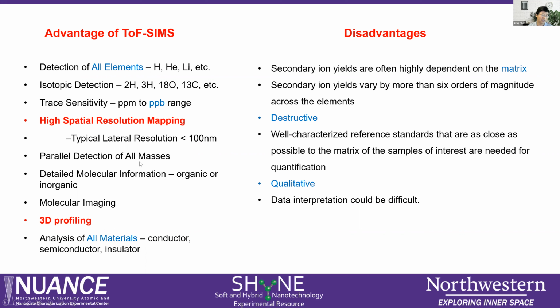And then parallel detection, that is very useful. For some method like XPS, you detect 2 elements and 10 elements, total different time. And if you analyze 10 elements, you spend like 2 hours on 1 element less because in theory to detect. This one is parallel. Once you get there, you collect everything parallel and simultaneously. And you can spend like a half hour to collection. And you have everything. And after that, you can spend 10 hours to analysis. And that is save a lot of time, parallel detection.